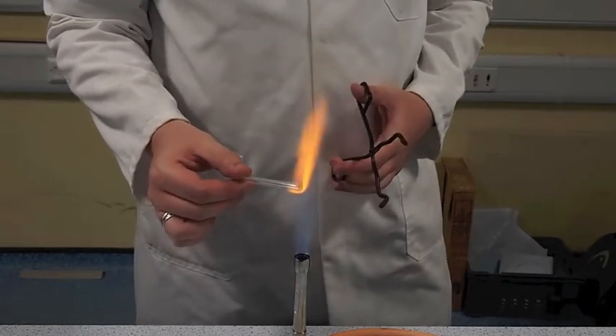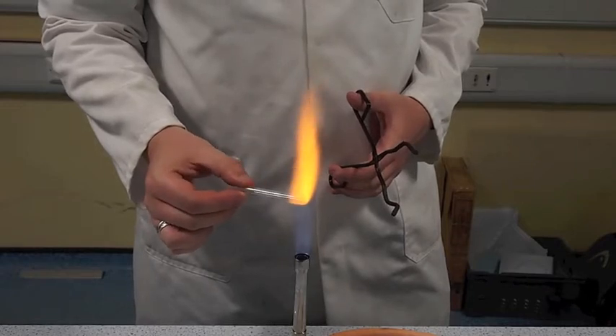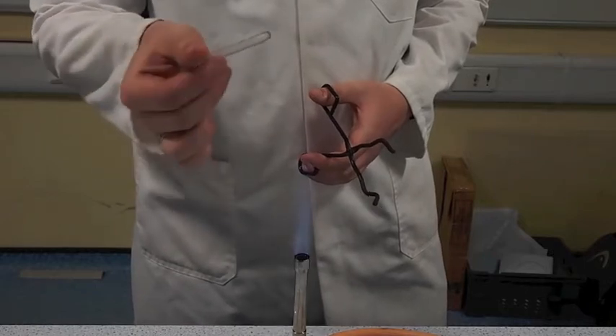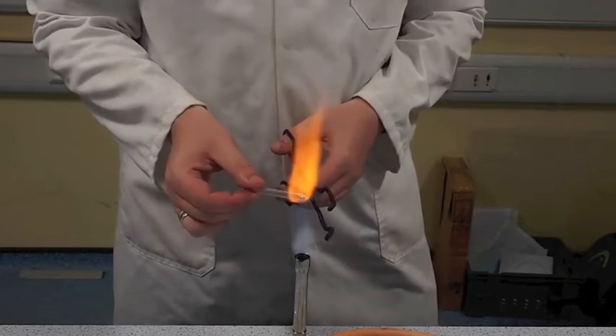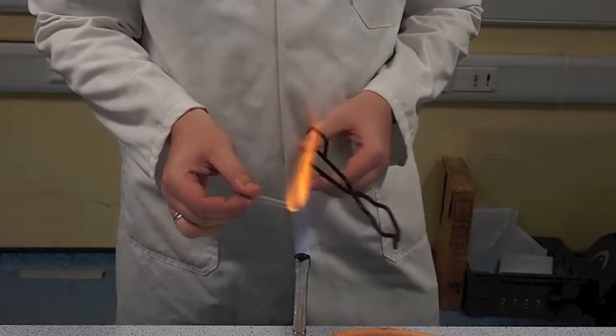Now there are probably much more sensible ways of doing this, but this is a way that I've found works well for me. So you can see it's just starting to melt and go over the top there, and all I'm going to do is seal it off like that.